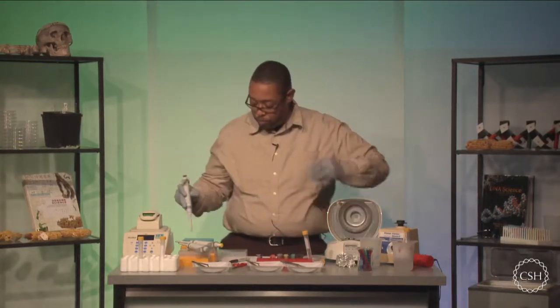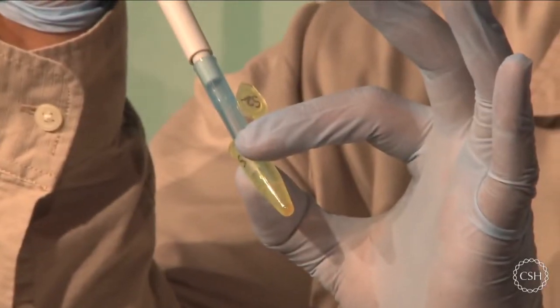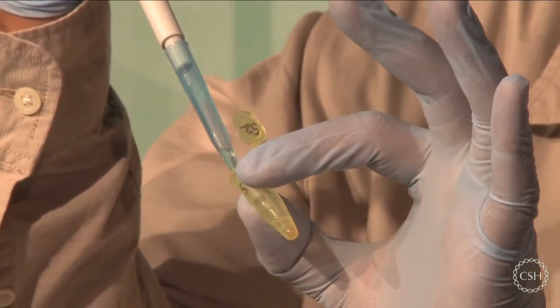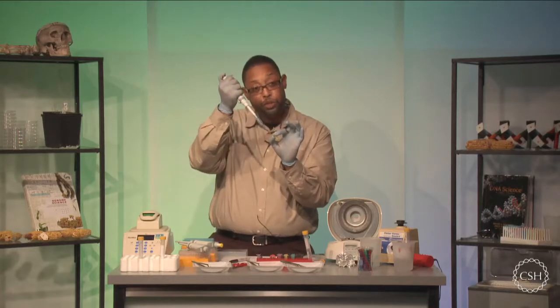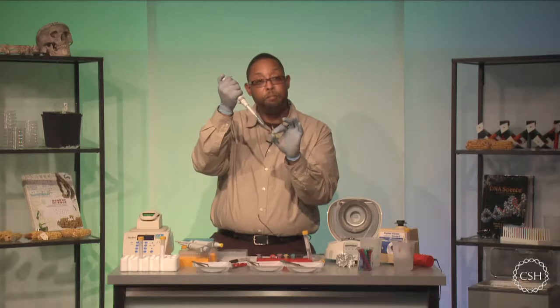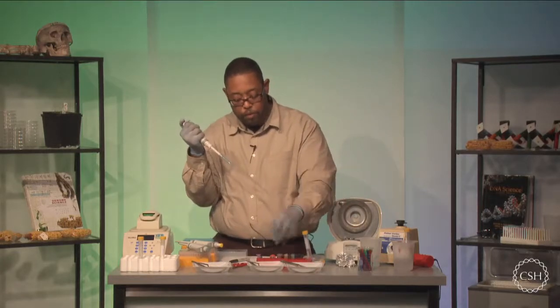I'm going to go to sample number two and do the same thing. I'm going to take 150 microliters from this test tube. Okay. Now what I notice from this sample is I have just a little bit of debris at the top of the supernatant. That's okay. Push through the little bit of debris at the top of the supernatant, go into the main clear area, and draw up your sample. It's okay that we have a little bit on the outside. We'll be sure during the transfer that we don't pull that over.